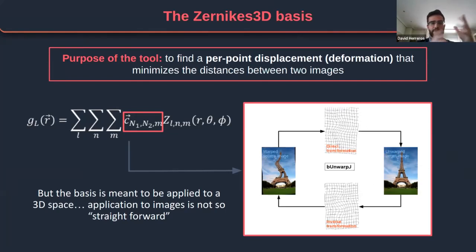These bases can be applied to volumes, can be applied to atomic structures, but here we are going to talk mostly on the topic of particles, CryoEM particles. And here the application of the basis is not so easy because the basis is defined in a 3D space. But if we want to find a per particle conformation, then we have to go to a 2D space. So this application is not straightforward.